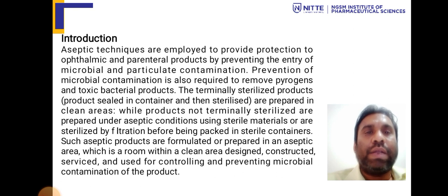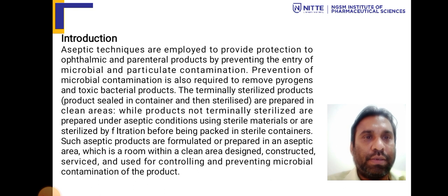Aseptic area or aseptic techniques are employed to provide protection to the ophthalmic and parenteral products by preventing the entry of microbial and particulate contamination. Prevention of microbial contamination is also required to remove pyrogens and toxic bacterial products.